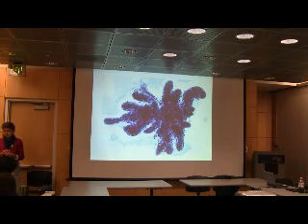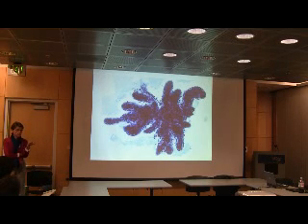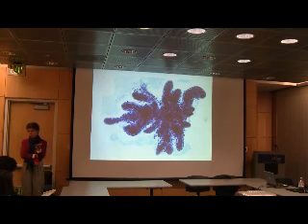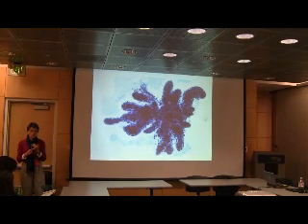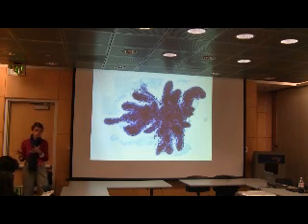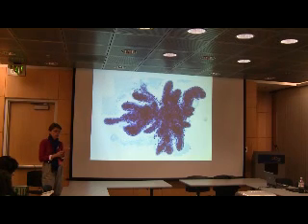Can you speak about, like you mentioned, when you get tissue from surgeries, you embed it in FFPE. How about frozen sections of tissue? Frozen is if somebody is in the operating room and they want to know about the tissue while the surgery is still going on. That would be most often when somebody has a sentinel lymph node done and they want to know if there's tumor in the sentinel lymph node, and sometimes from the breast itself. It takes too long to process it through formalin into a paraffin embedded situation. That would be the next day, and clearly we can't wait for that.